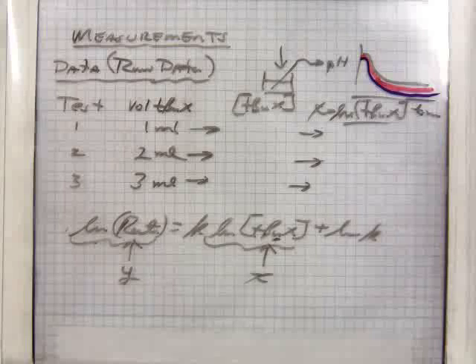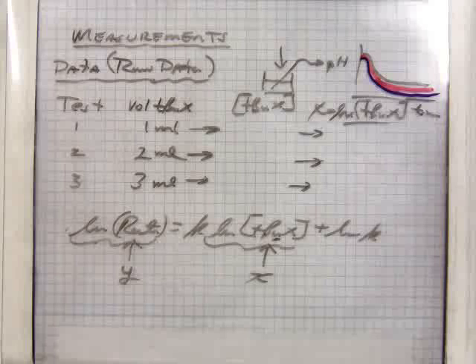Then you take the ln, see up here, ln, which is in that equation that we had over here. You will have that X term, and that's what that's about. And so that will be your X plot. And that'll be, and I've got it over here, X1. And then you inject 2 mils. Now this table right here is good for all of the experiments. So you can put this table into your notebook as X, Y, as all your exponents.